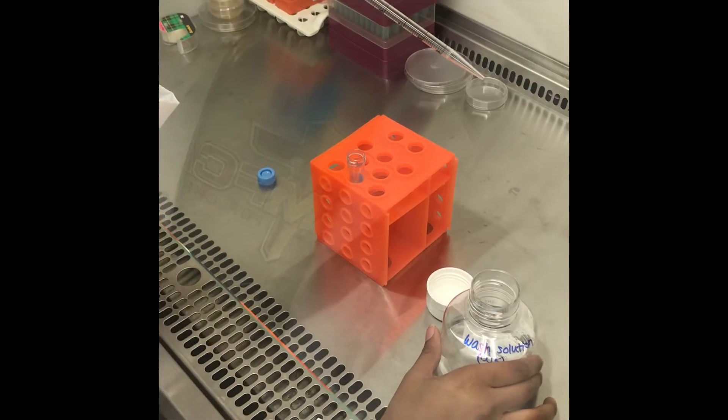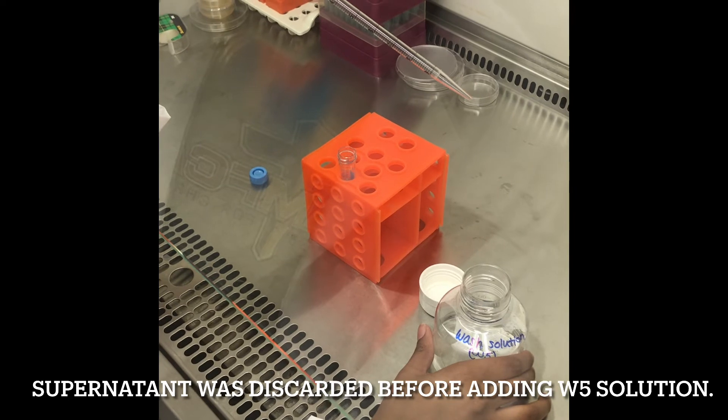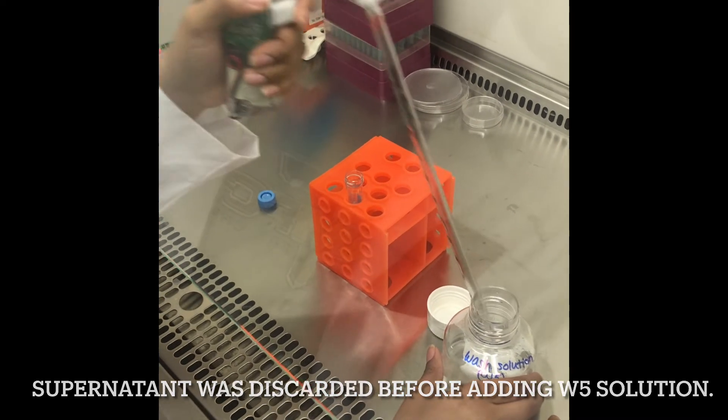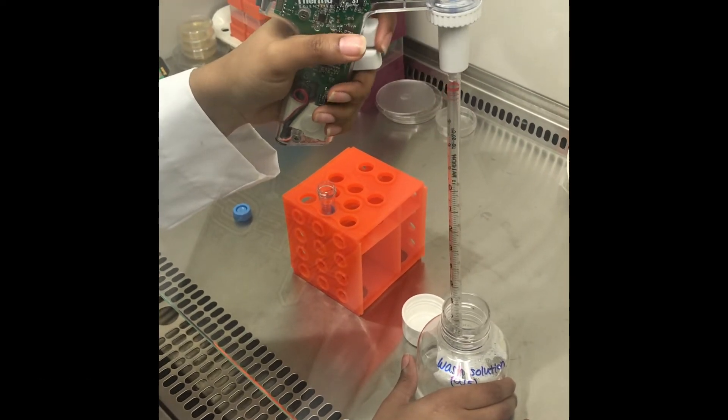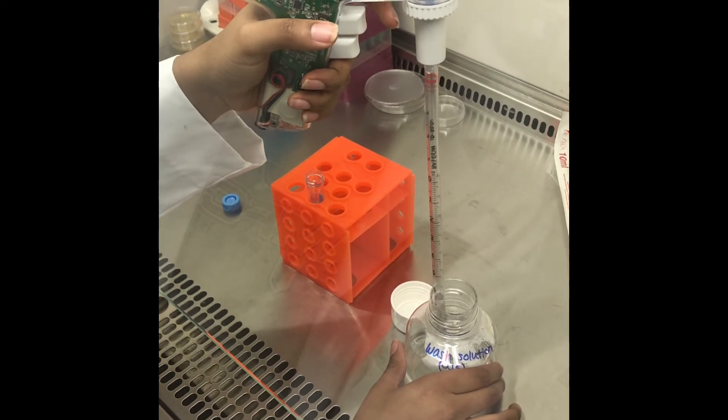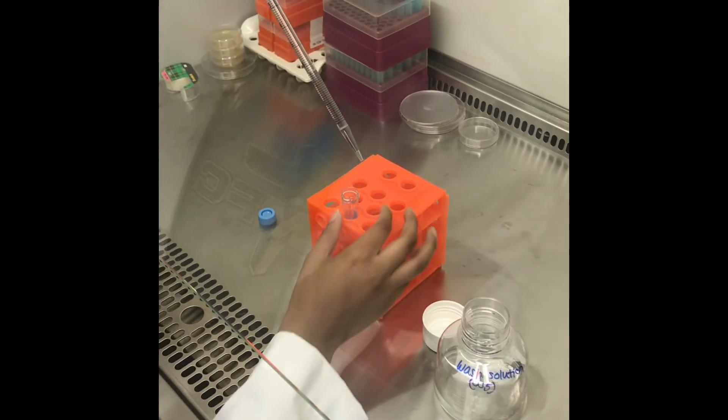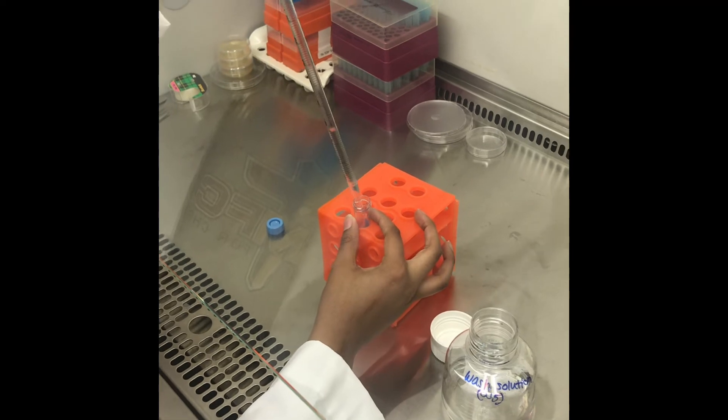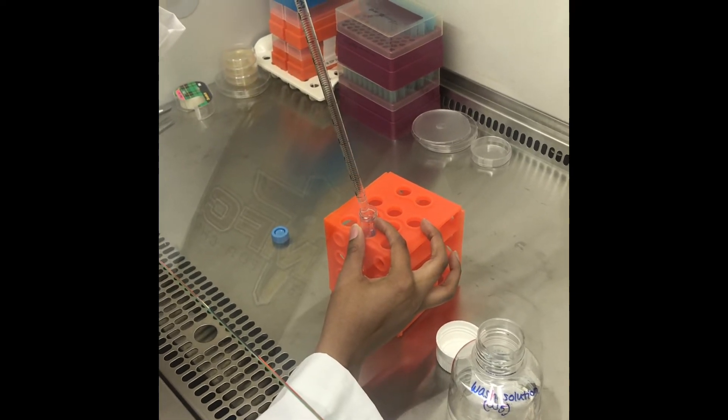So now we're going to take our W5 wash solution and wash our protoplasts. We're taking approximately three milliliters.